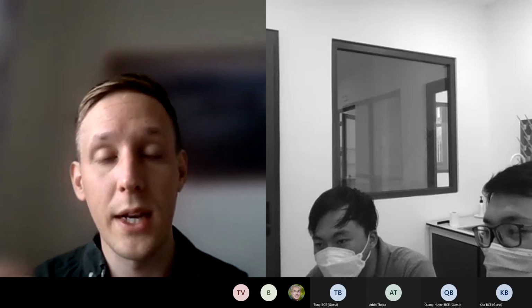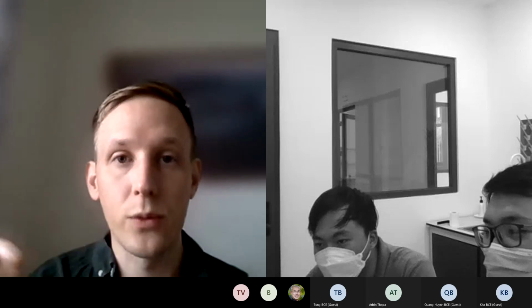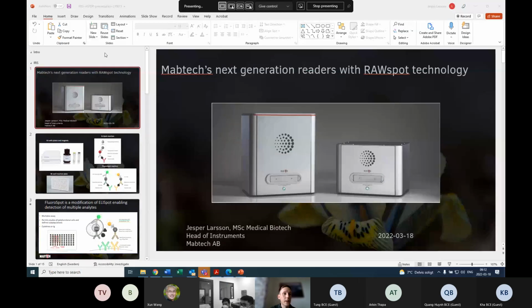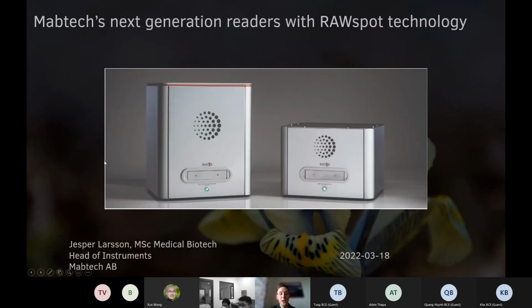And then, of course, on Monday, we will continue with software training so that you learn all the different software features and so on. So I'm going to share my screen again and show you a slightly different presentation. Just feel free to ask me any questions as we go if you want things to be clarified. Can you see my screen right now? Yes, we can see. Perfect.